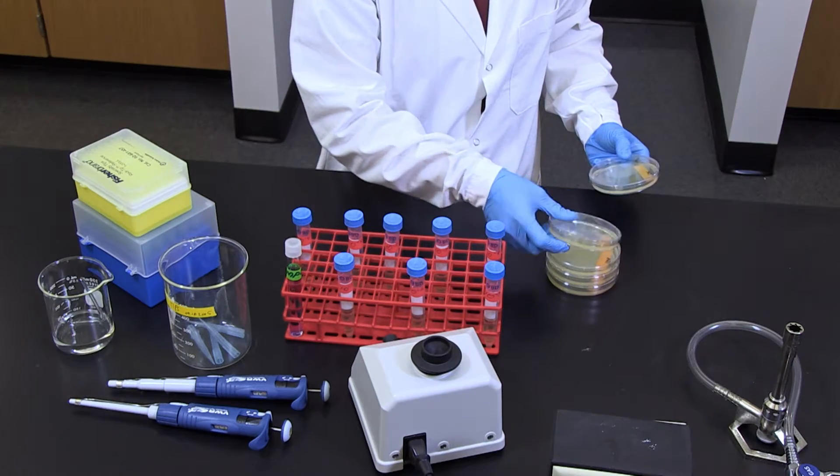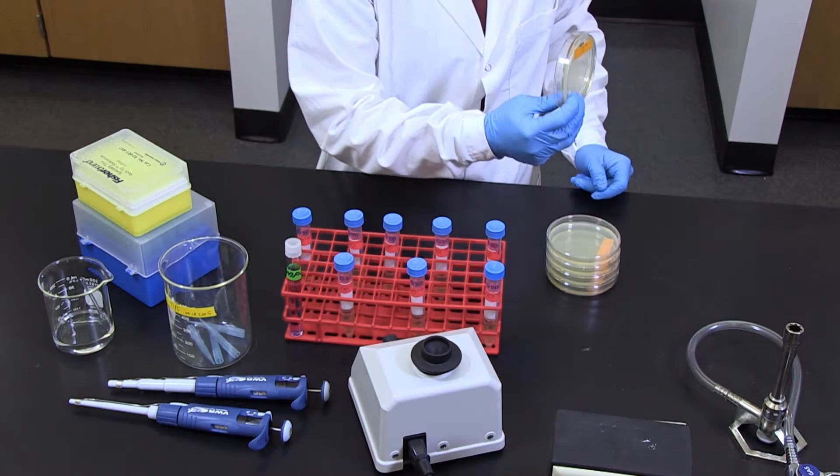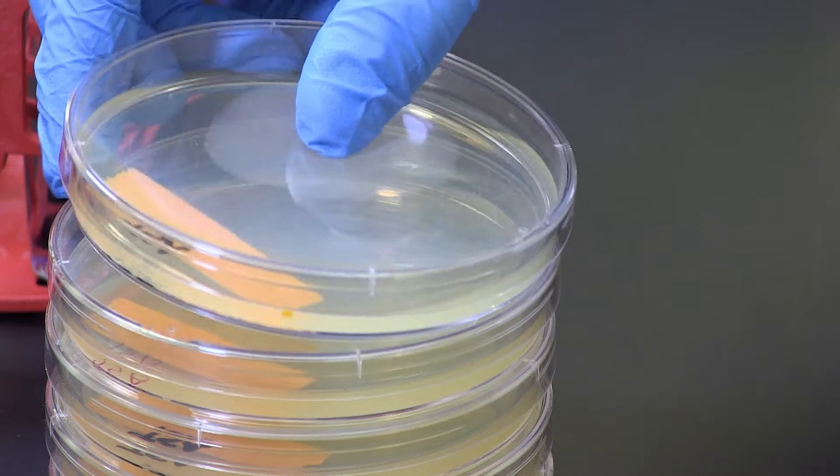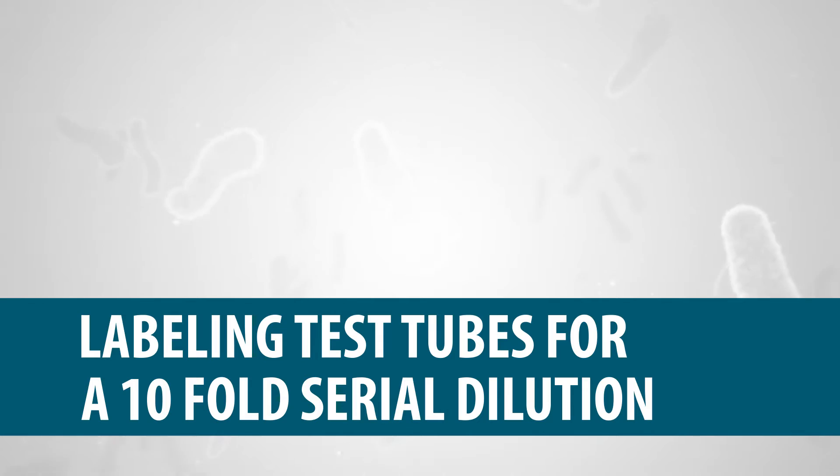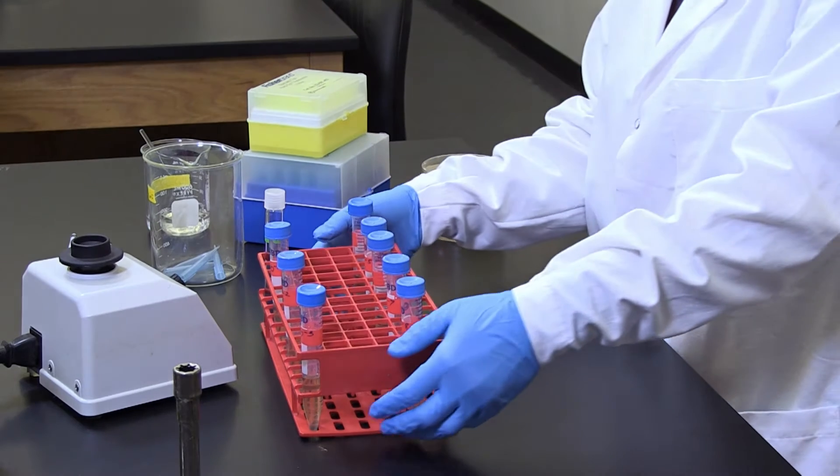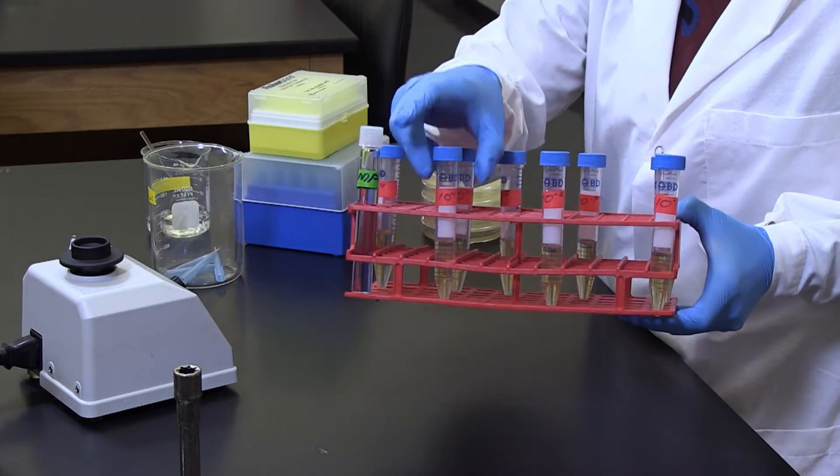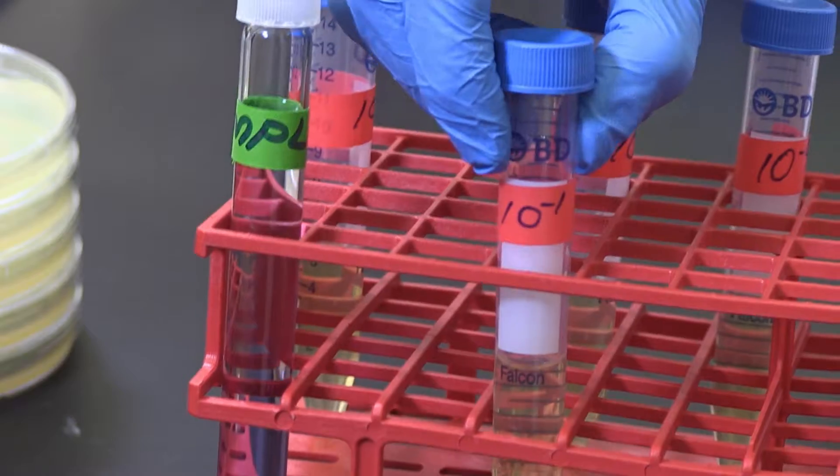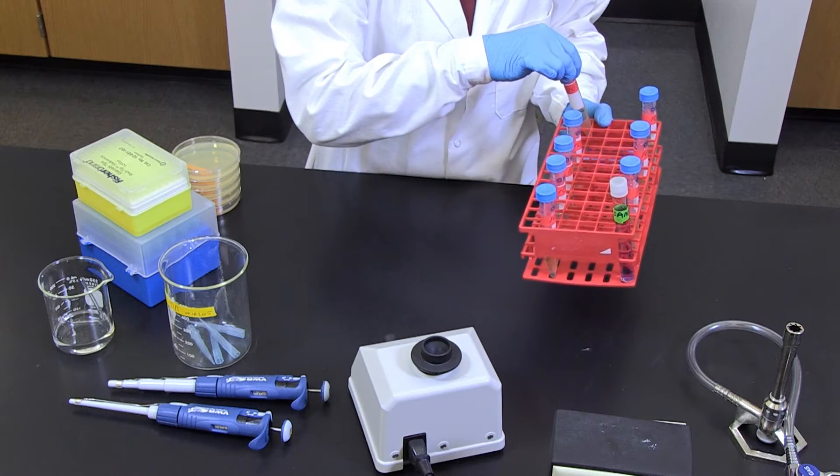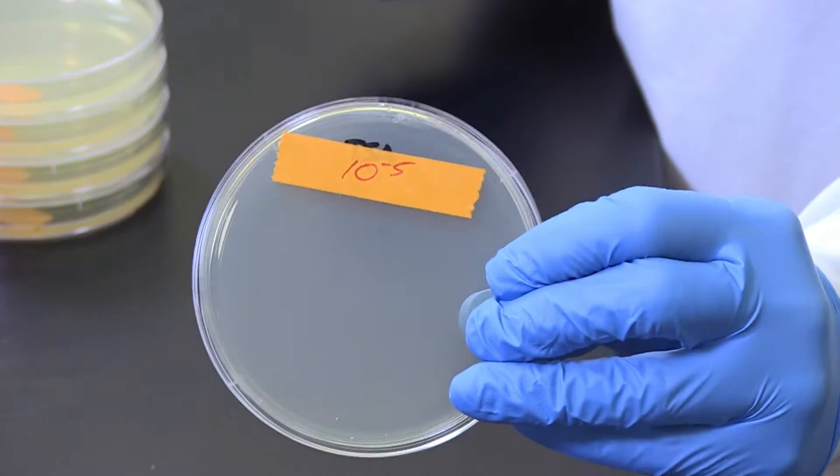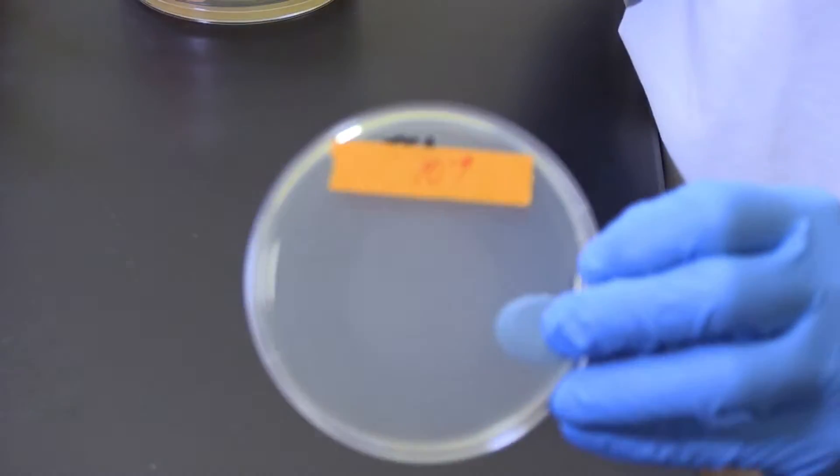Bacteria are serially diluted and plated onto agar plates using aseptic technique. First, label eight 4.5 milliliter broth test tubes from ten negative one to ten negative eight, and five agar plates from ten negative five to ten negative nine.